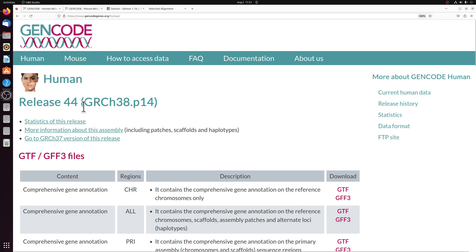We're going to start by downloading the reference files that we need, and I'm going to be using GenCode, which is a manually annotated and easy to use reference database.